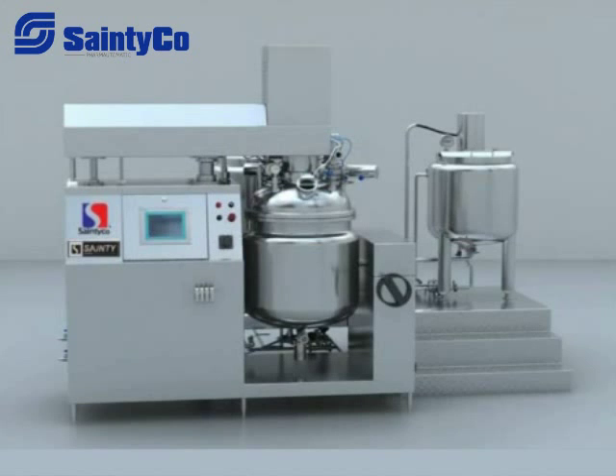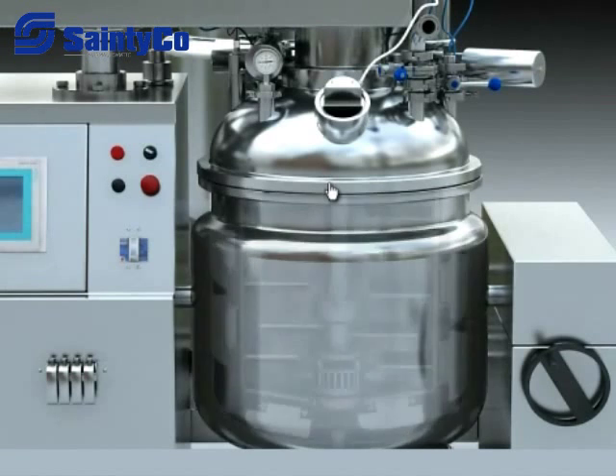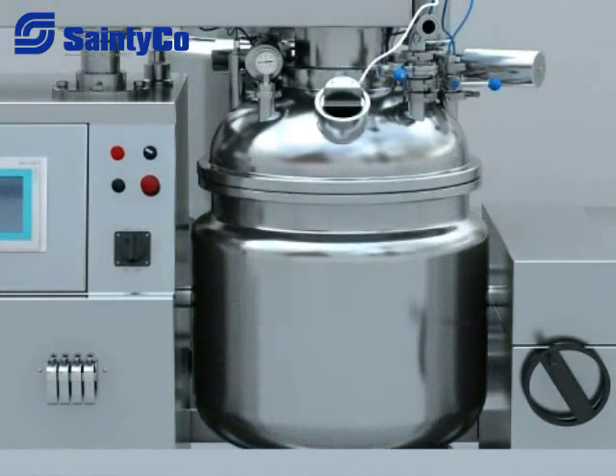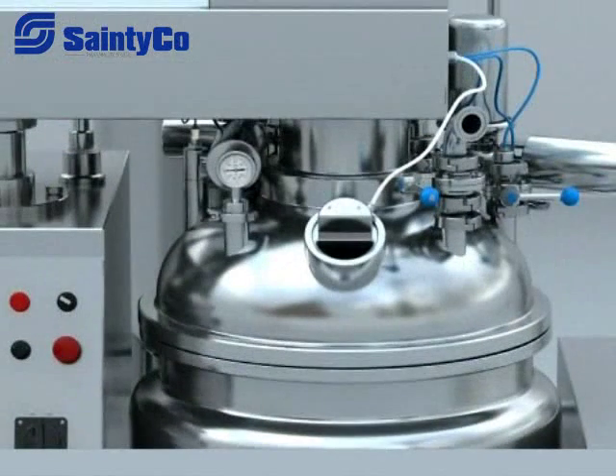Composition of the emulsifier. 1. The emulsifying mixing tank has a three-layer structure with upper and lower ceiling heads. The lower ceiling head is connected with the tank by flange, and the thermal protective layer adopts PU foam technique. There is a high-speed emulsifying mixer and a forward and reverse low-speed mixing device in the tank. At the bottom of the tank there are a thermostatic discharge valve and a temperature sensor.